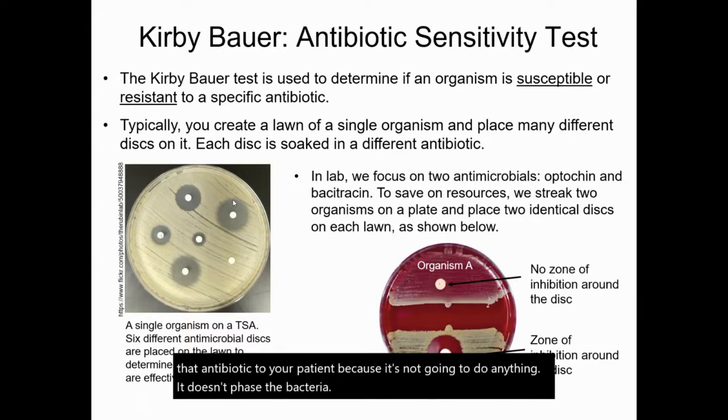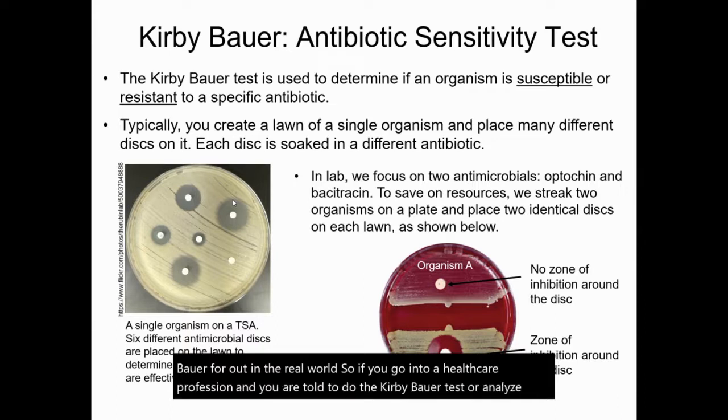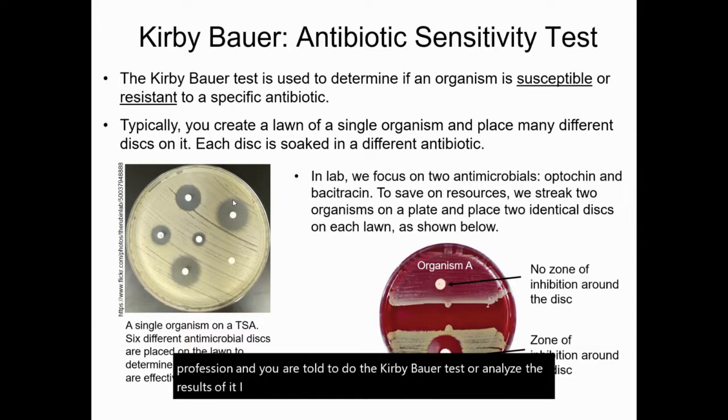So how we use Kirby Bauer in the lab is more for identifying an unknown organism. Okay, so it's a little bit misleading. So what I first want to talk to you about is what we actually use Kirby Bauer for out in the real world. So if you go into a healthcare profession and you are told to do the Kirby Bauer test or analyze the results of it, I want to make sure you know what's going on.